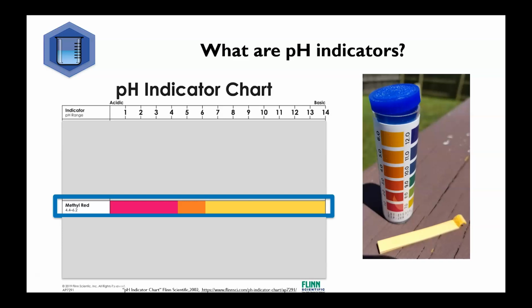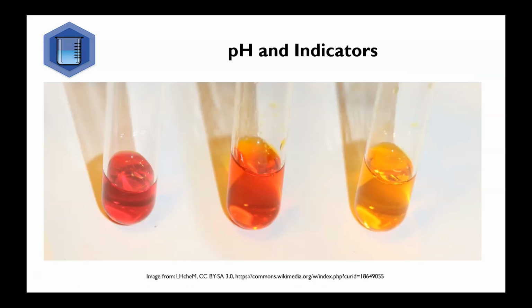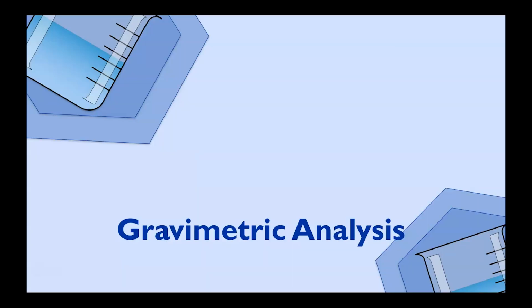However, you will need to be able to interpret the information provided to determine what would be a good indicator to use in a different situation. Carefully read through the procedure to identify the indicator that we will use in this experiment and the color it starts out as and changes to, keeping in mind that you'll see 3 different colors as the pH changes.